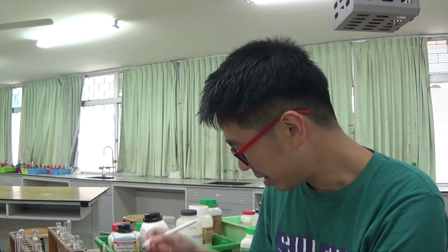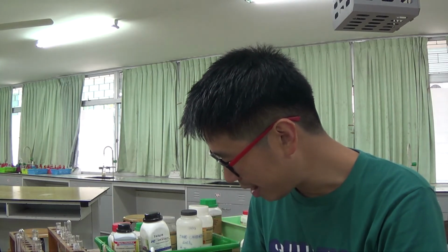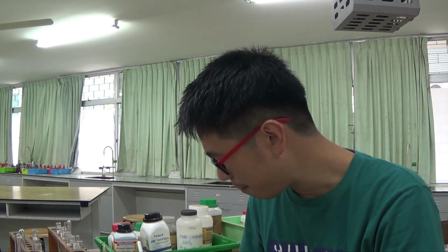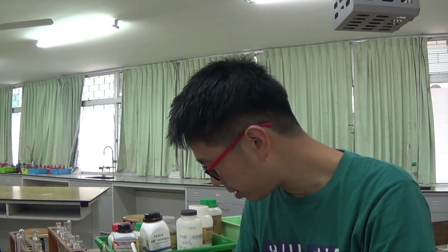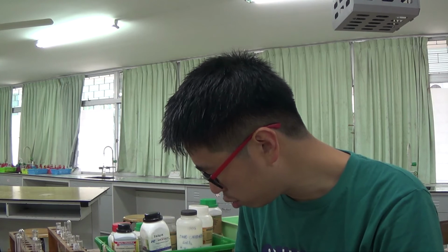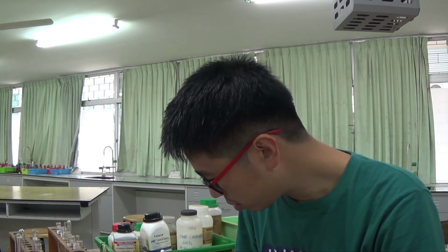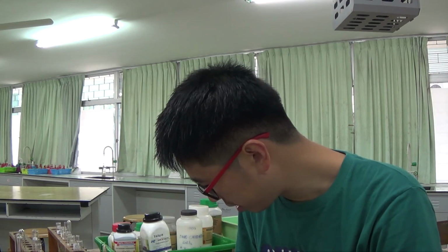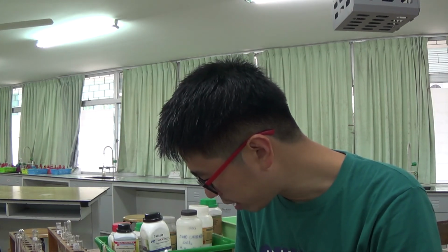Okay, so the last cation that I want to talk about is actually something that is in the A-level paper 3. Oops, what am I doing? The A-level paper 3 is the manganese 2 plus ion. So this is called manganese 2, or they call it Mn2+ aqueous.